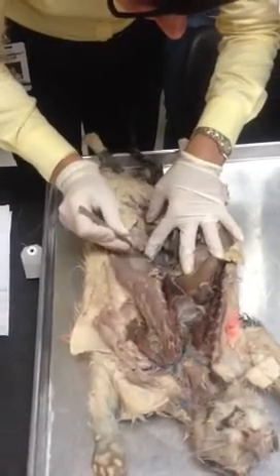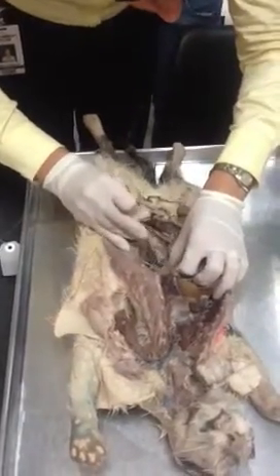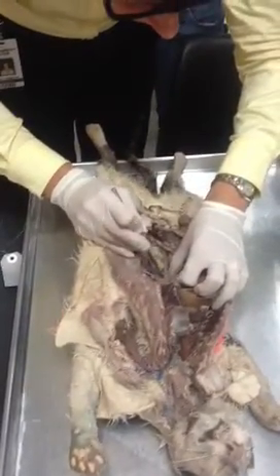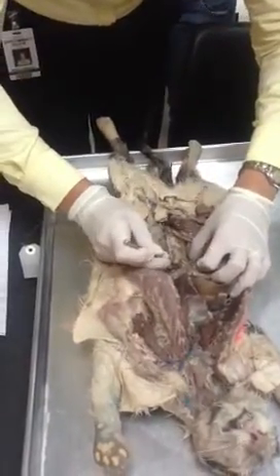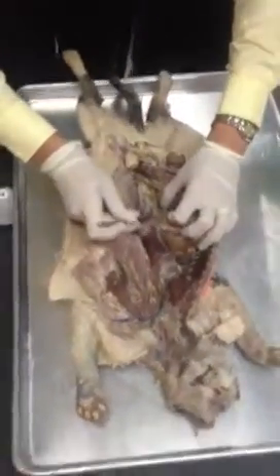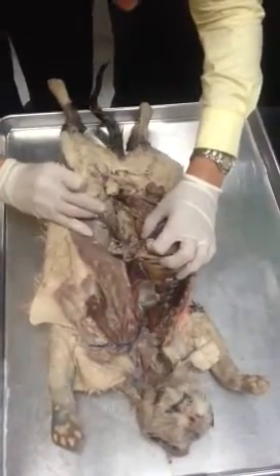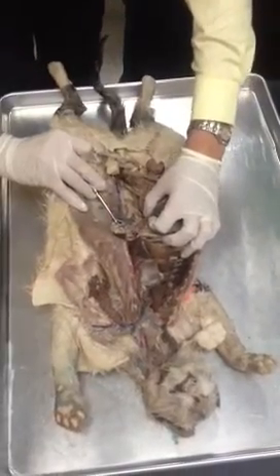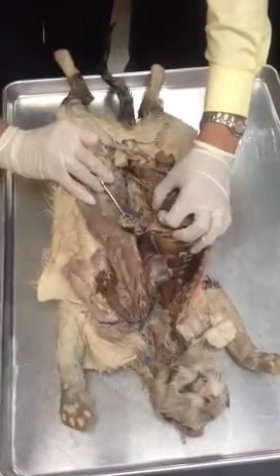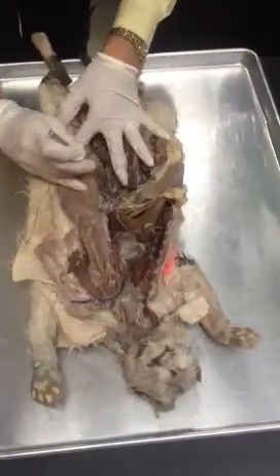Right. There is some kind of flow, or maybe a little anomaly in this cat. That we see it better on this side, right? Here on the right side we see the renal artery, and about the renal, right here, this would be suprarenal. Suprarenal goes to adrenal gland, right? Suprarenal, renal.